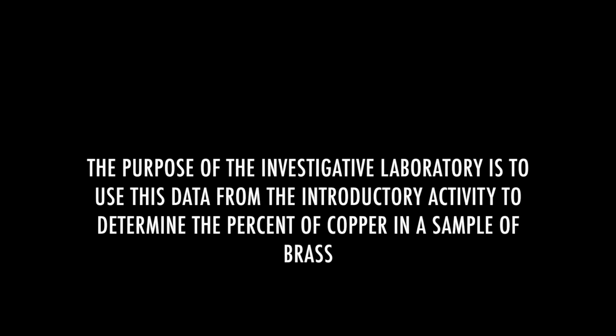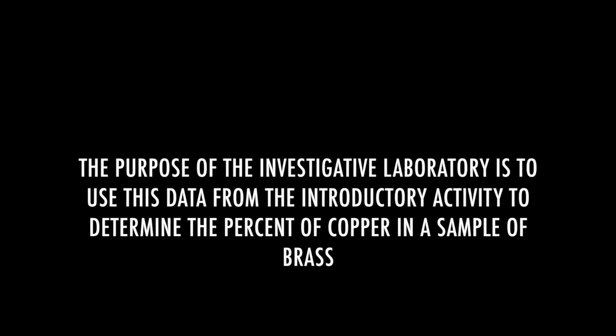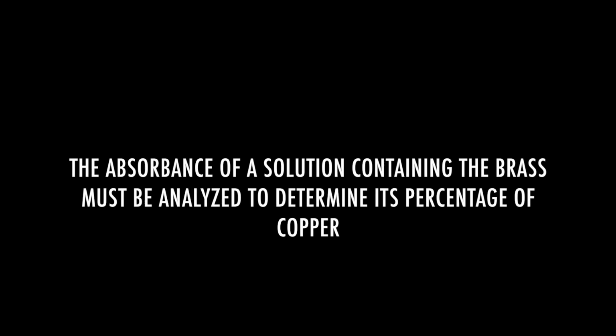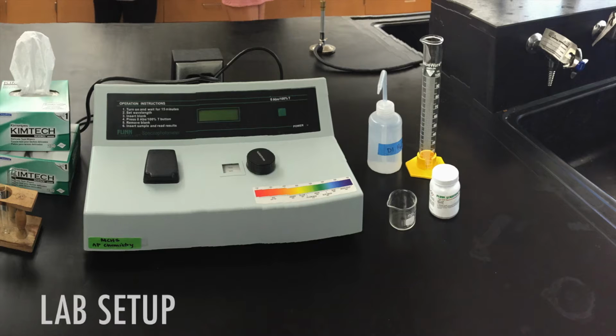The purpose of the lab is to use this data from the introductory activity to determine the percent of copper in a sample of brass. The absorbance of a solution containing the brass must be analyzed to determine its percentage of copper.